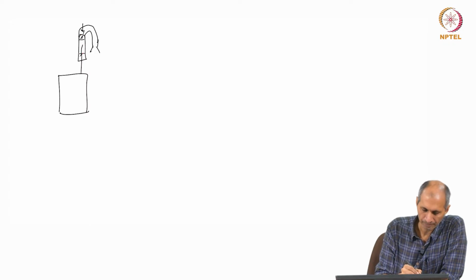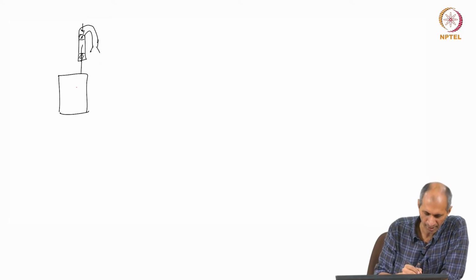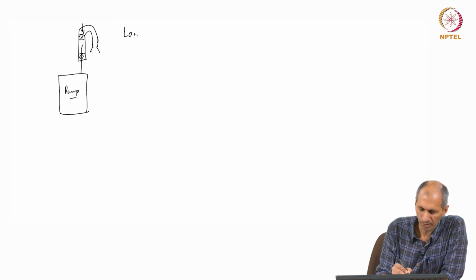So commercially they do that. It is inverted so that nothing accidentally falls into it, which is not part of the vapor phase. And this is a pump. This is a low volume pump. This is a low volume sampling.